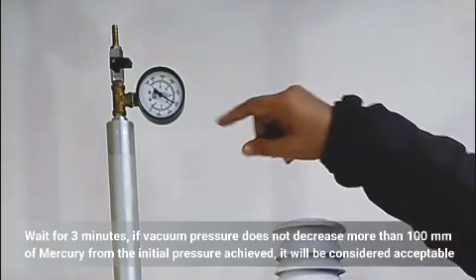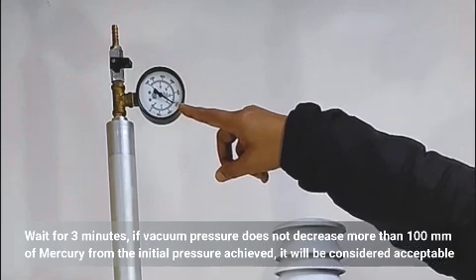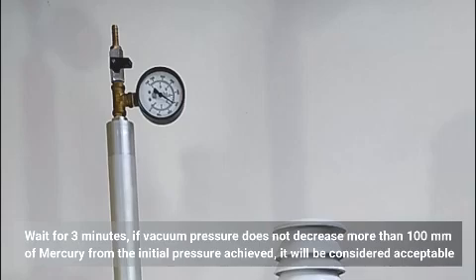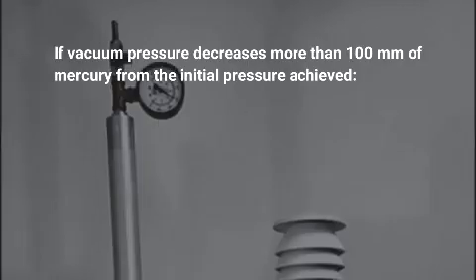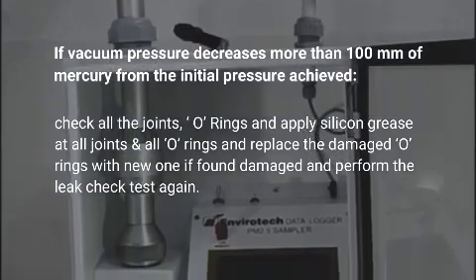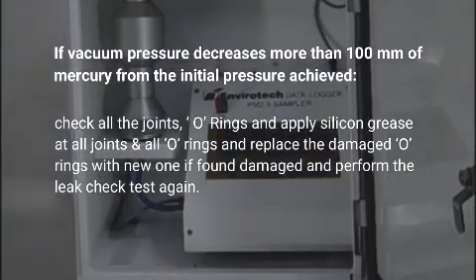Wait for 3 minutes. If vacuum pressure does not decrease more than 100 millimeters of mercury from the initial pressure achieved, it will be considered acceptable. Otherwise, check all the joints, O-rings and apply silicone grease at all joints and all O-rings and replace the damaged O-rings with new ones if found damaged and perform the leak check test again.